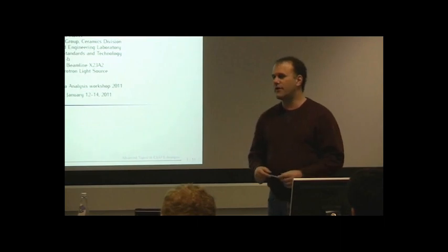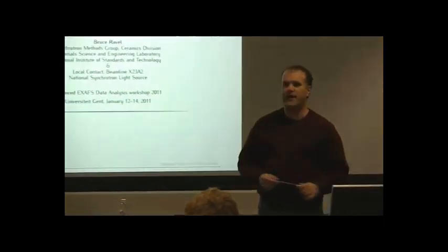I put in a few more paths, did some parameters, hit the fit button again, and got a fit, and I said, well, this is a good fit. And then I kind of stopped the lecture. But what I didn't really talk about in any great detail yesterday was how you decide what a good fit is. Or another way to phrase that is you could spend hours and hours poking at the buttons in Artemis, tweaking the parameters, playing with your data, and how do you know when to stop? You can always do something a little bit more.